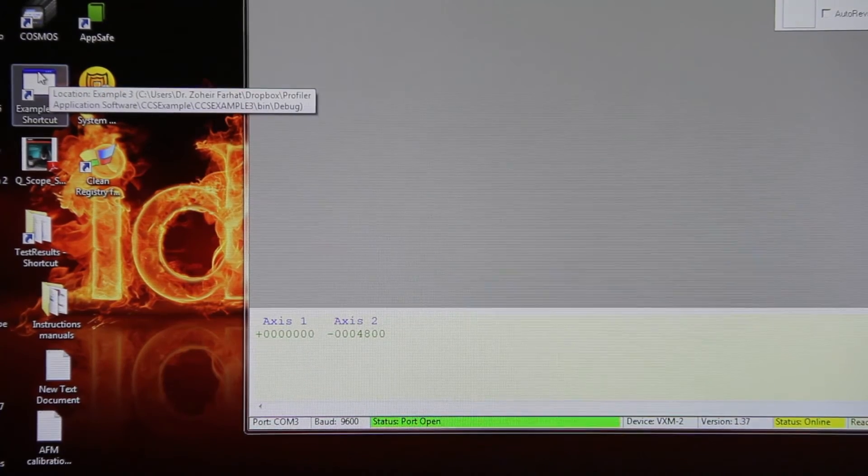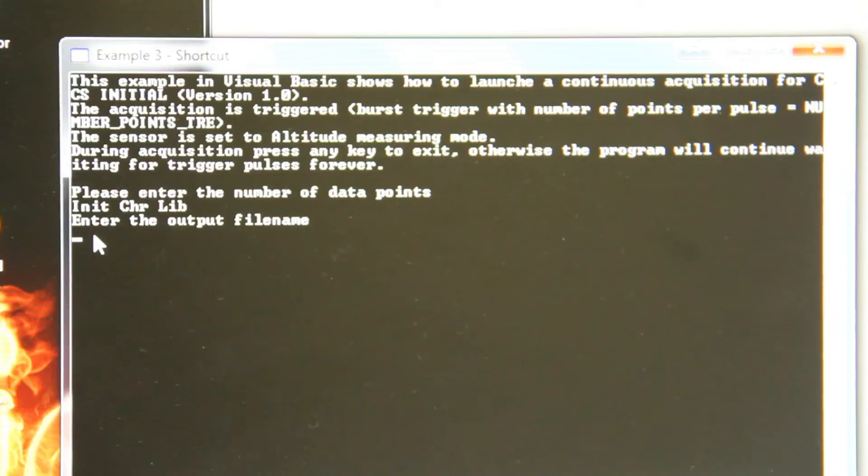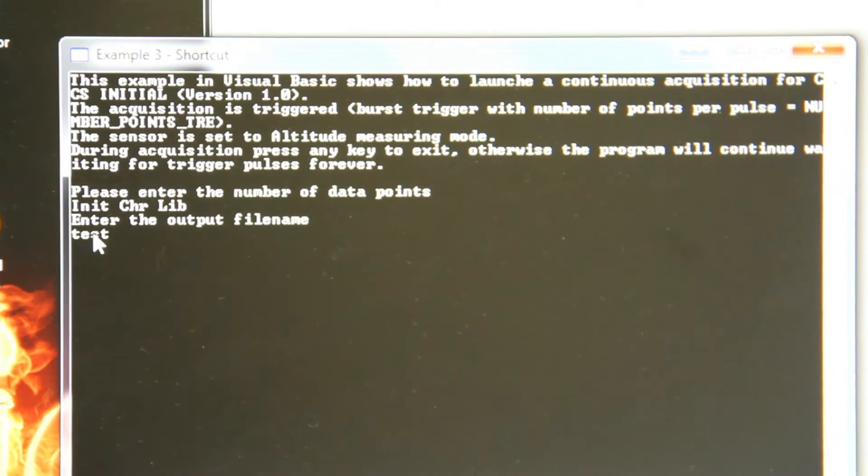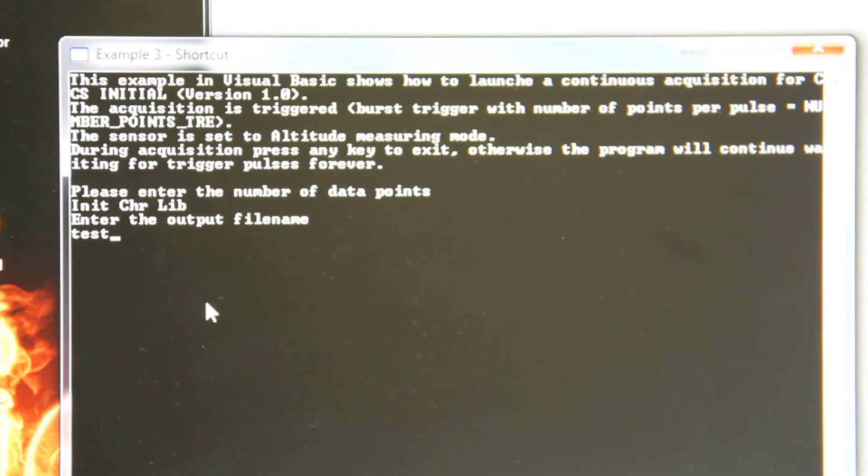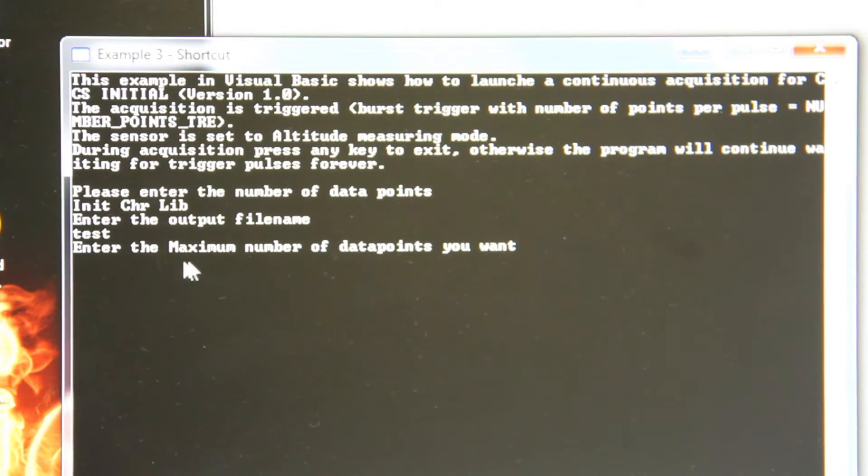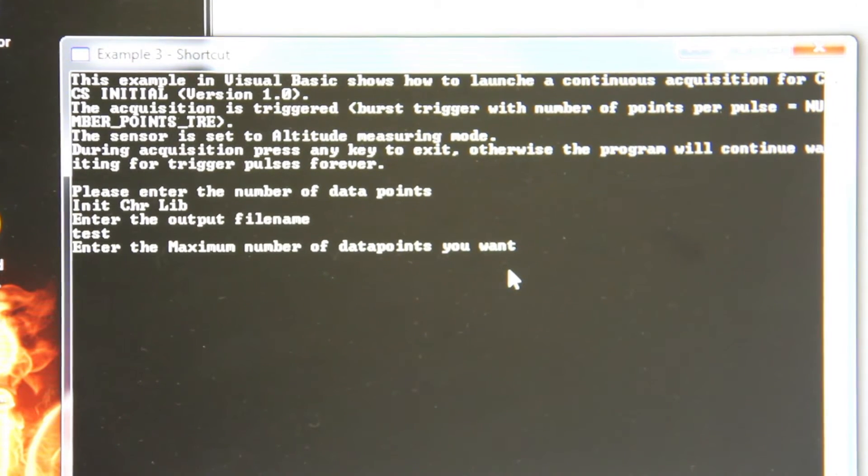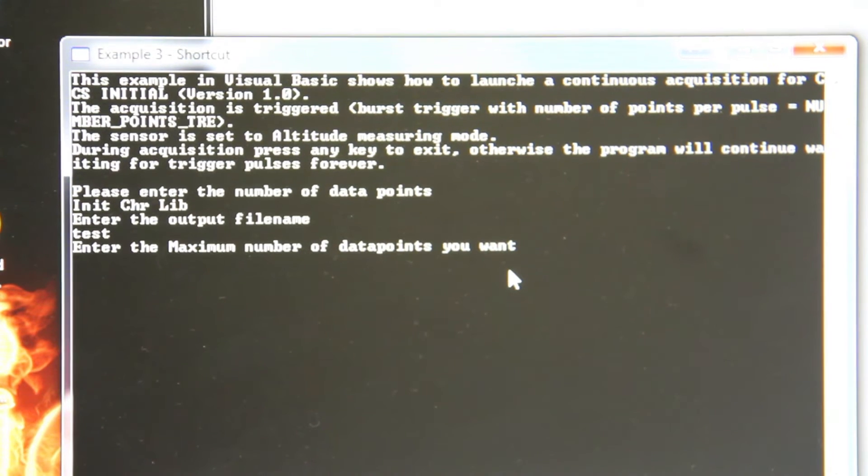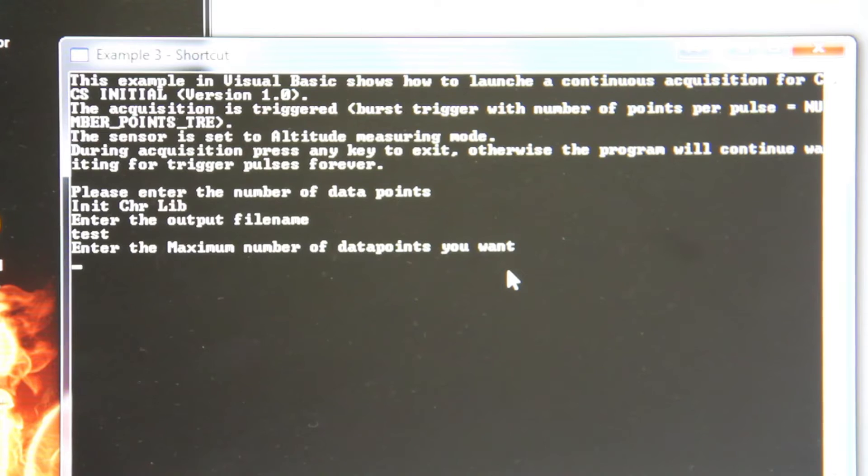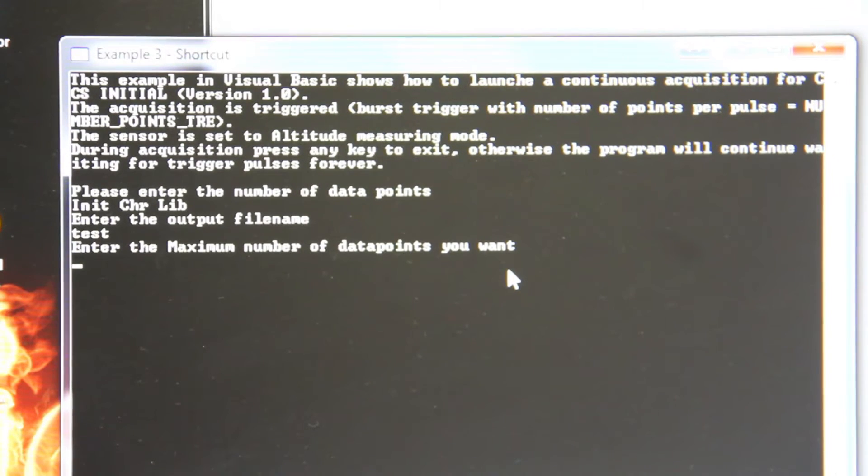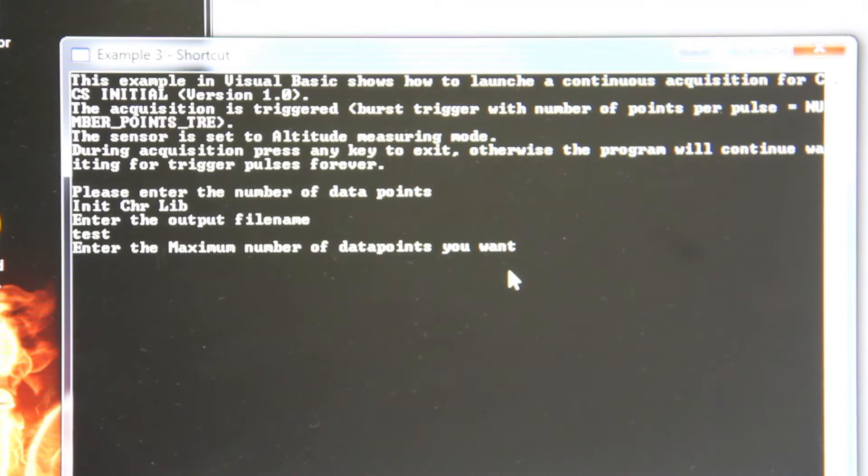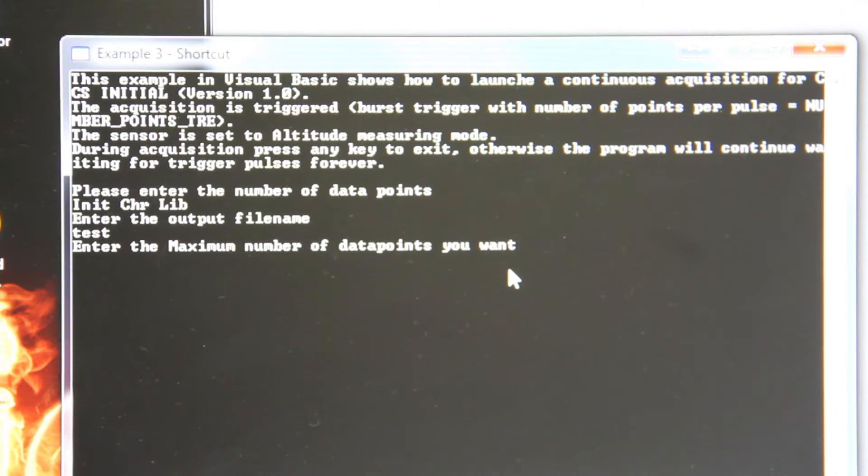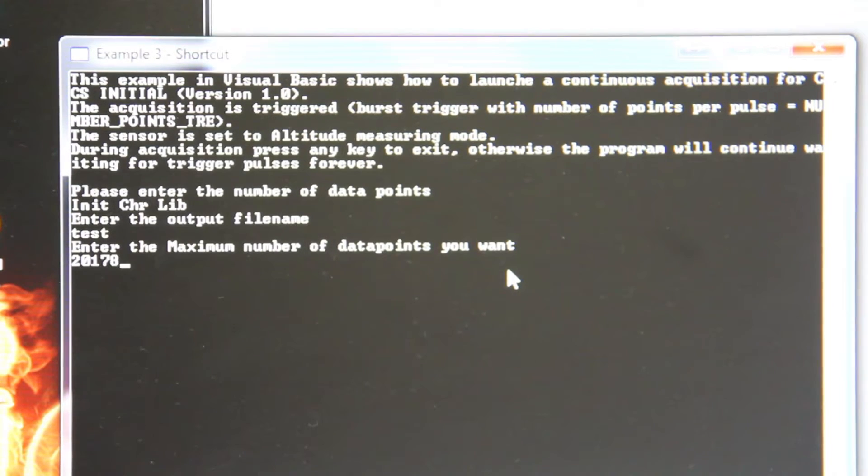Click example 3 shortcut from desktop. Enter the output file name as test. Enter the maximum number of data points you want. So it will be the multiplication of number of loops in X and Y direction. In our case, number of data points in X direction is 114 and number of data points in Y direction is 177, so the total number of data points we have is 20,178.